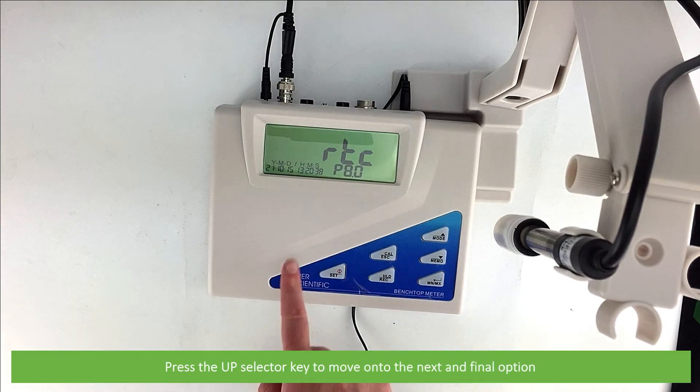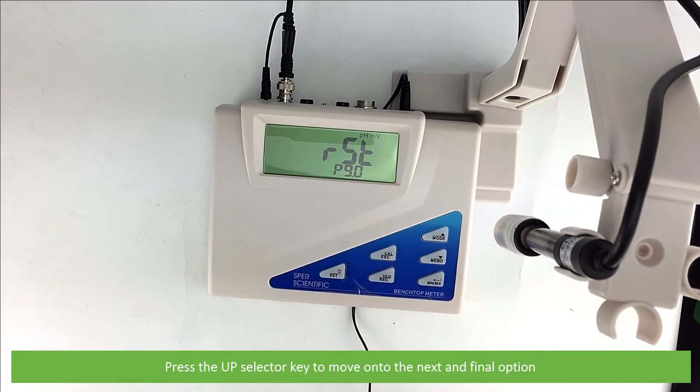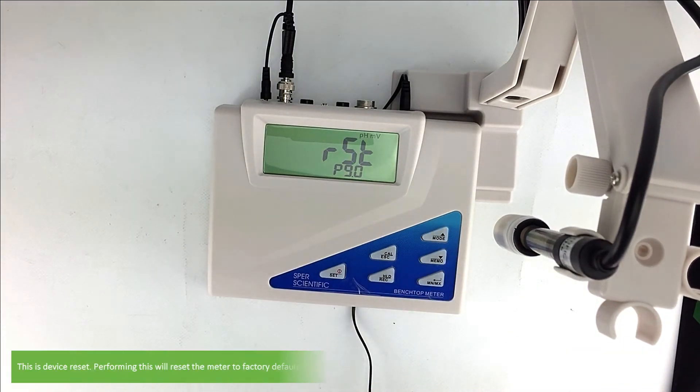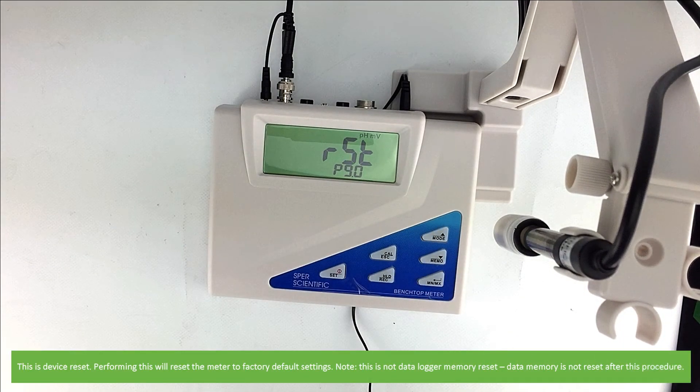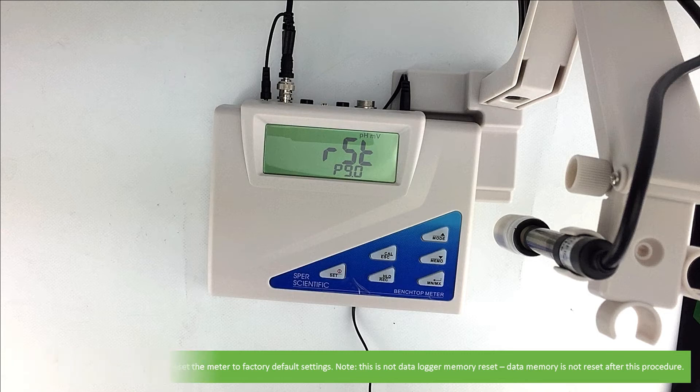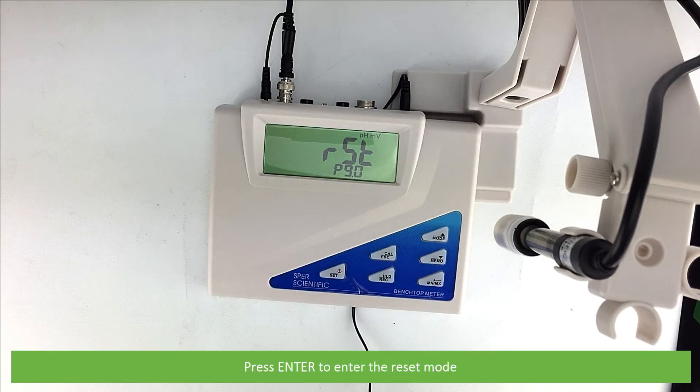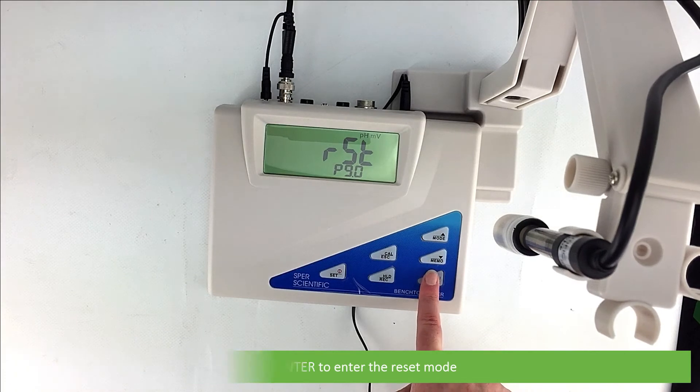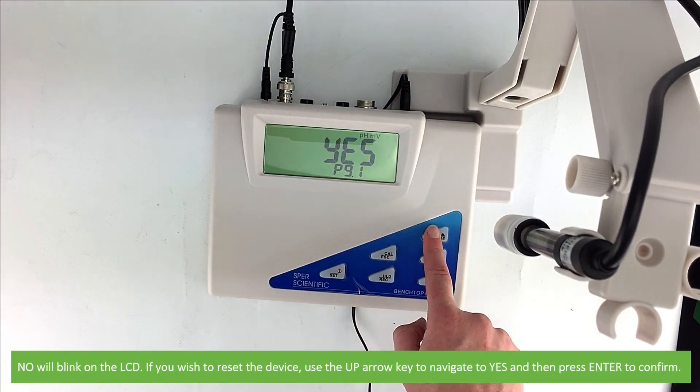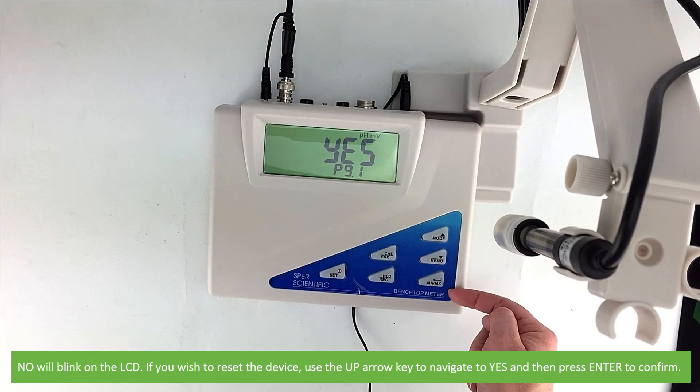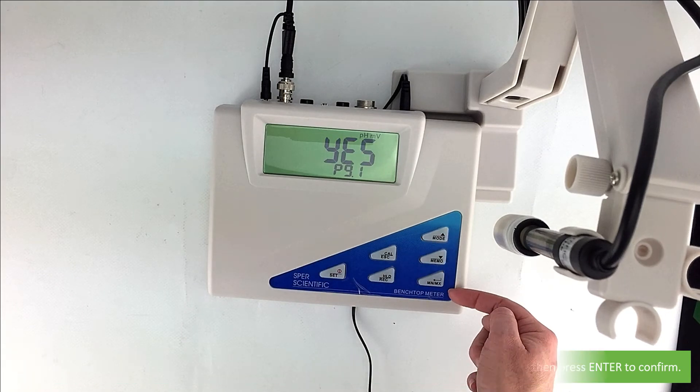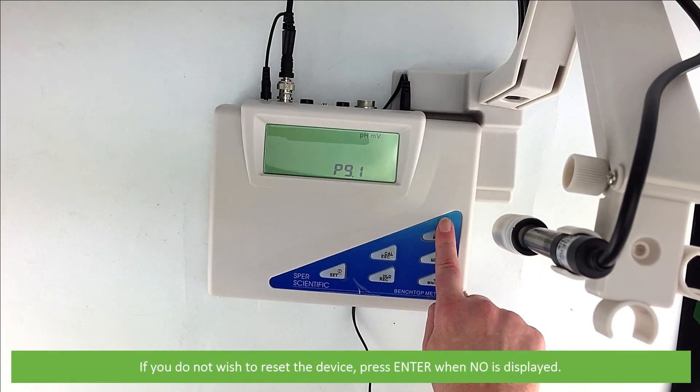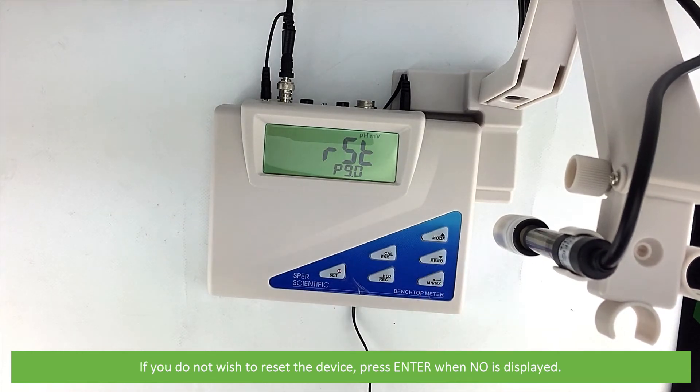You can then press the up selector key to move on to the next and final option. This is device reset. Performing this will reset the meter to factory default settings. Note this is not memory data logger reset. So data memory will not be reset after this procedure. Press enter to select the reset mode. No will blink on the LCD. If you wish to reset the device, use the up arrow to navigate to yes, then press enter to confirm. If you do not wish to reset the device, press enter when no is displayed.